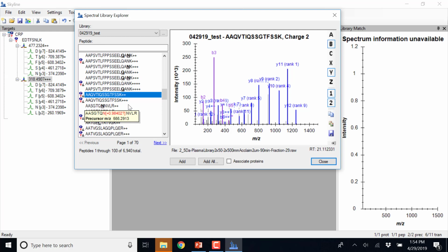All right, so what is underlined is where the modification is, and where it is underlined, the spectrum that correlates with it is usually matched from the database search with site localization confidence. And so if there were 2 amino acids that could have the modification and it was only found once in the peptide, it would only show you what it could confidently point at, 1 amino acid. If it was detected at both, then it would show you 2. Yeah, that's my understanding. Okay.